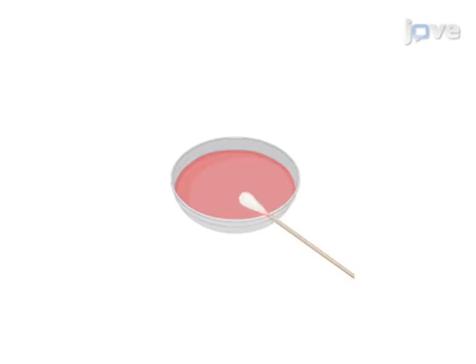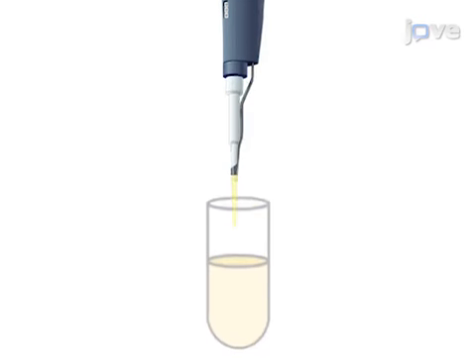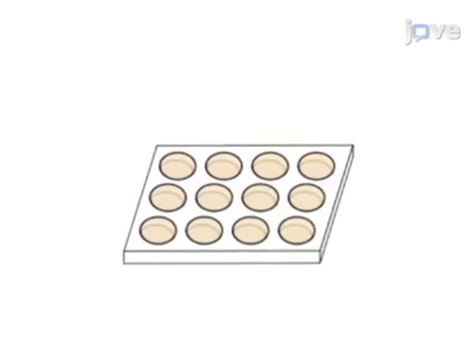The second step is to co-culture H. pylori with gastric epithelial cells. Next, process the co-culture samples for scanning electron microscopy.